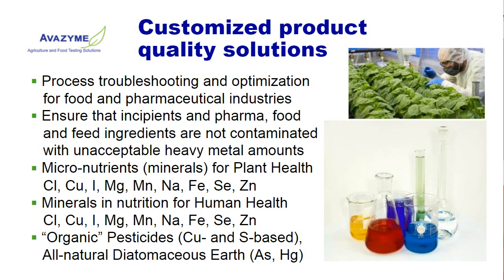So here iodine, of course, is important, but also iron, selenium, zinc can help to improve human health. The same is true, by the way, for animal health. Some of these metals and minerals play an important role in animal health as well.